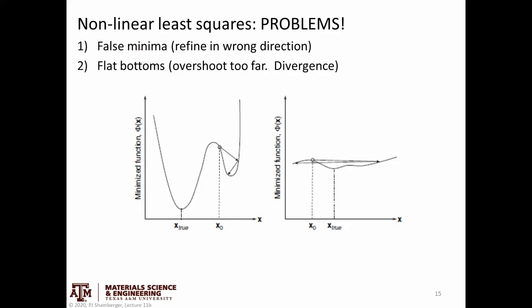There are a couple of general problems you might encounter when doing a refinement, since this is a nonlinear function. The two biggest are false minima — if you start in the wrong place or refine things in the wrong order, you can get trapped in these false minima and have to back up or choose a different starting position — and parameter explosion, where parameters overshoot and get into non-physically real values, causing the fit to rapidly degrade.